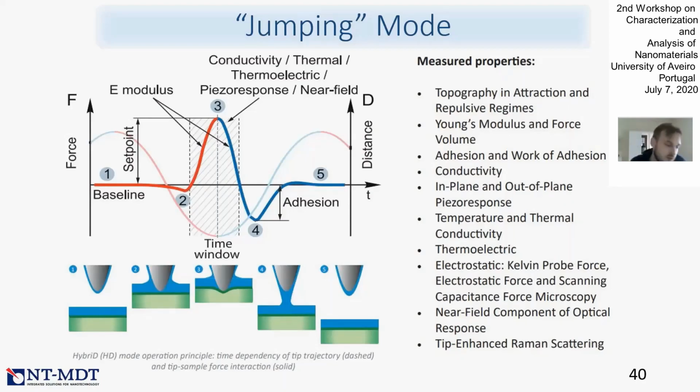You can collect many force signals in a second, collect all this data in a big array, and after that do post-treatment of the collected data with mathematical processing. And after that you may operate in some feedback mode or without feedback. You can organize feedback just with very fast acquisition and treatment of the force data.